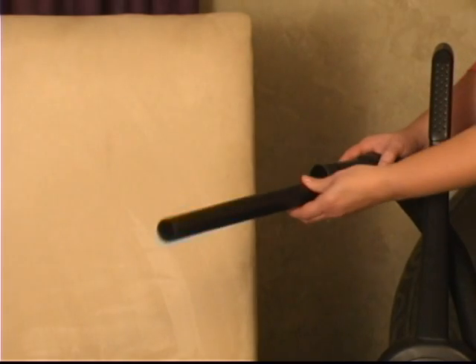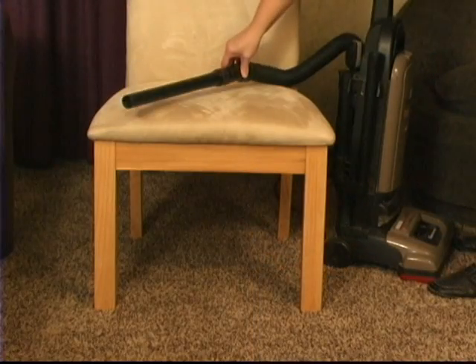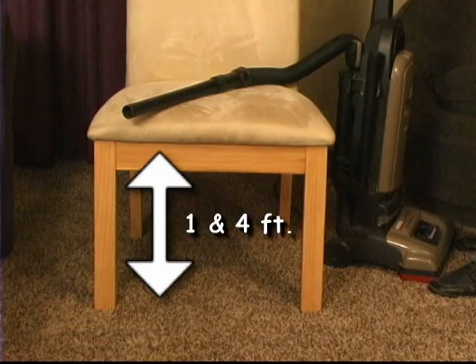Step 1. Hook up the attachment hose to the vacuum cleaner without any attachment ends. Set the attachment hose between one and four feet off the floor, perhaps on the seat of a chair or ottoman.